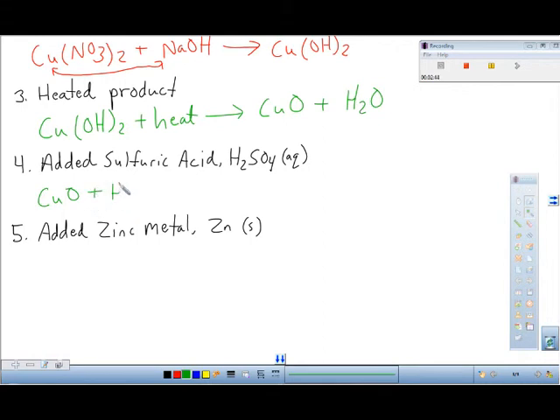The next day, we scraped the black solid off the filter paper and added sulfuric acid, H2SO4. This produced another chemical reaction - the copper and hydrogen switched places. The copper combined with the sulfate to produce blue copper sulfate solution, CuSO4, and the hydrogen combined with oxygen to make water.